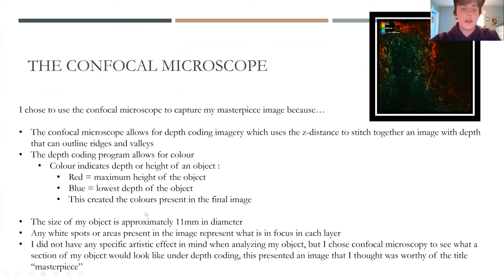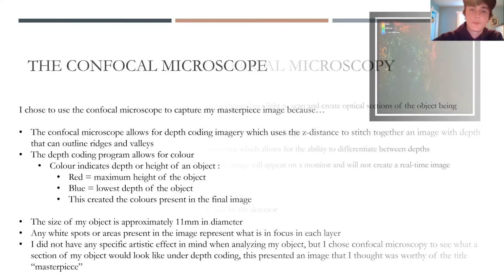I did not have any specific artistic effect in mind when analyzing my object, but I did choose confocal microscopy to see what a section of my object would look like under the depth coding. This presented an image that I thought was worthy of the title masterpiece.